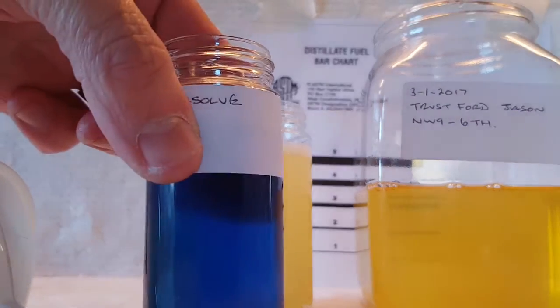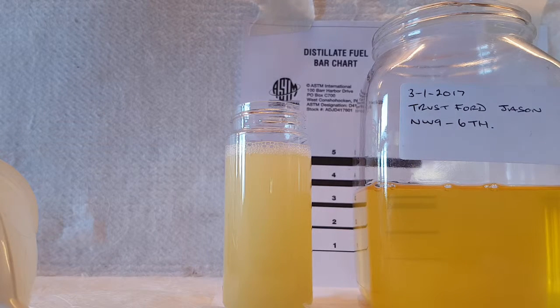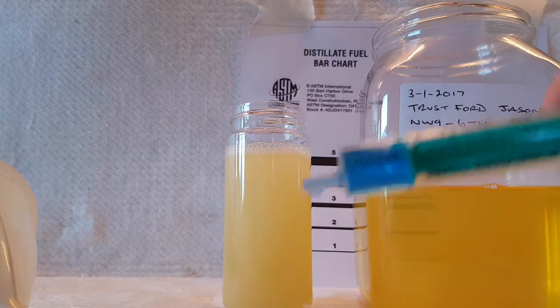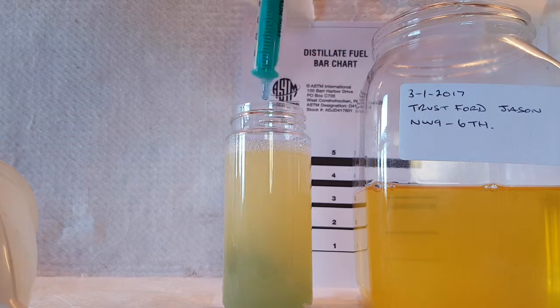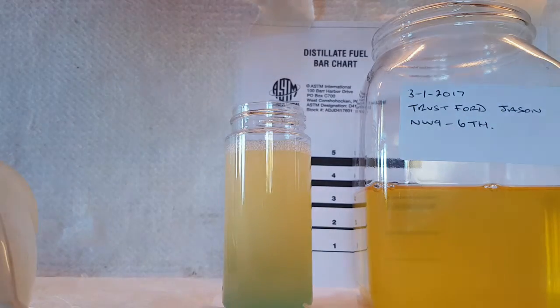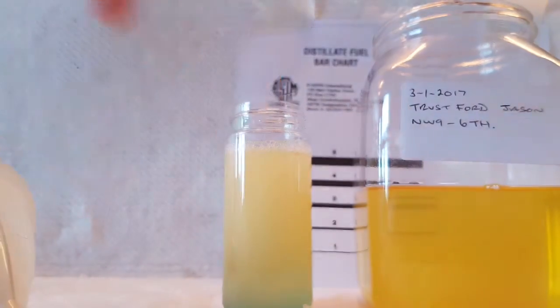So I'll now put a little bit of Aqua-Solve, and I'll just put a corrective dose in. I've got a corrective dose of about 1.5ml, which is more than I have. Stick that in, put my lid on. You can see at the bottom it's starting to clear a bit.